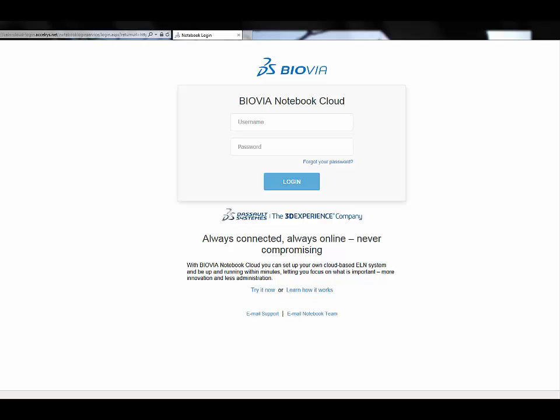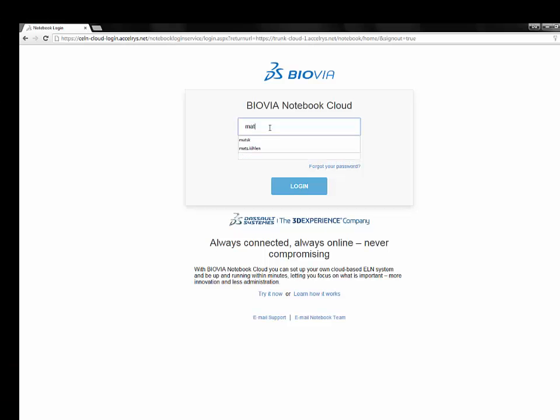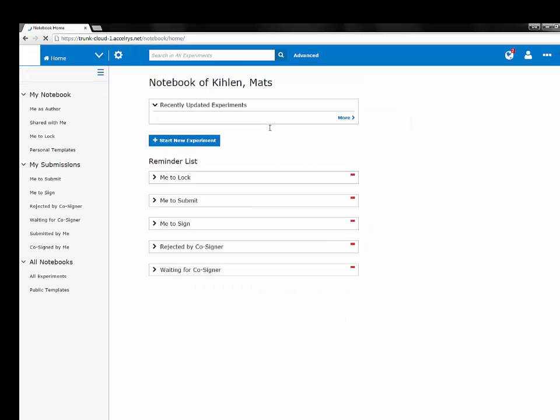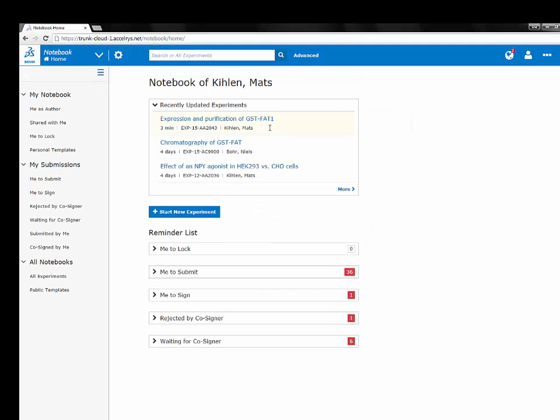A driving factor in updating the web client was the need to be able to work on mobile devices, such as tablets. You will notice that the homepage has a very similar look and feel to the previous one. Recently updated experiments, the ability to start a new experiment, and the reminder list.